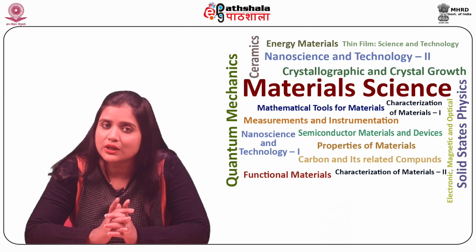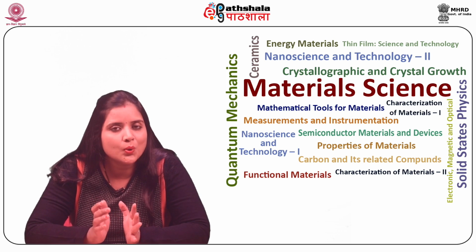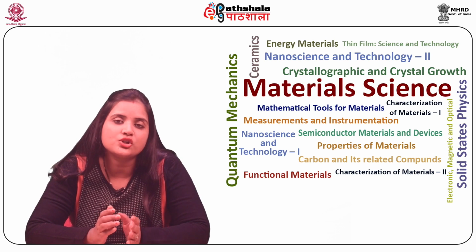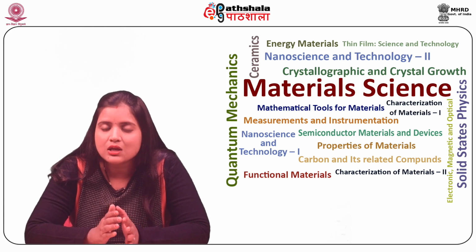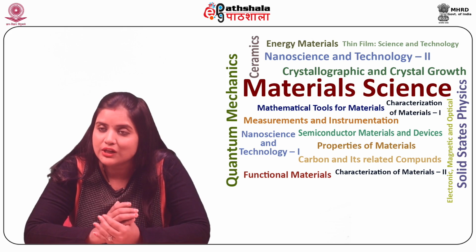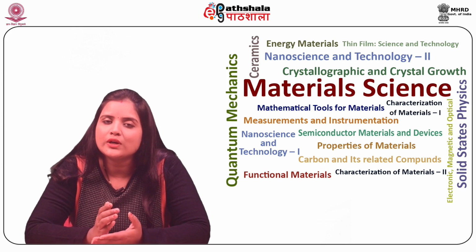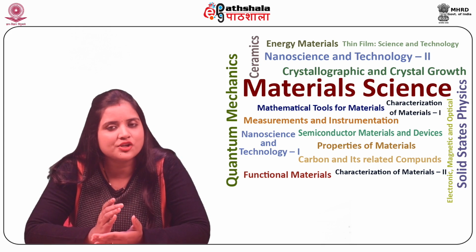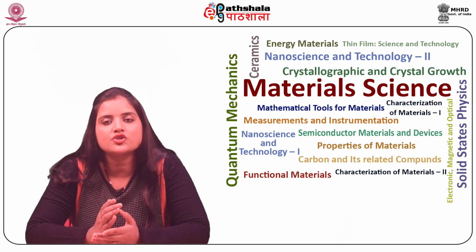Traditional microscopy techniques, not employing a reference wavefront, record only intensity information, while the important information about the specimen is lost. This technique was developed by Dennis Gabor in 1948 while he was improving the resolution of an electron microscope, wherein the correction of aberrations in the electron imaging lens became a critical technological challenge.